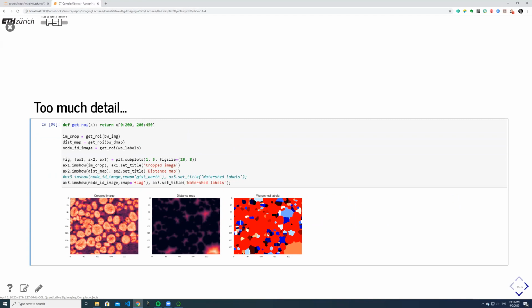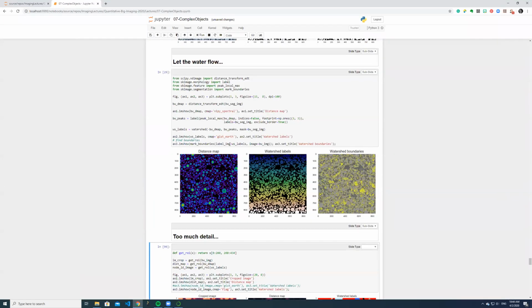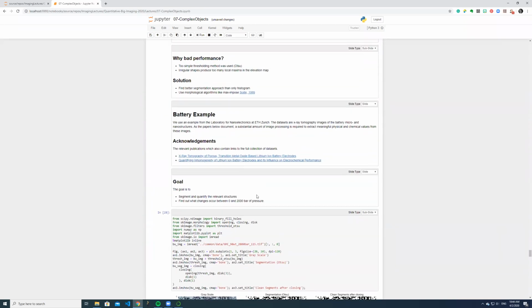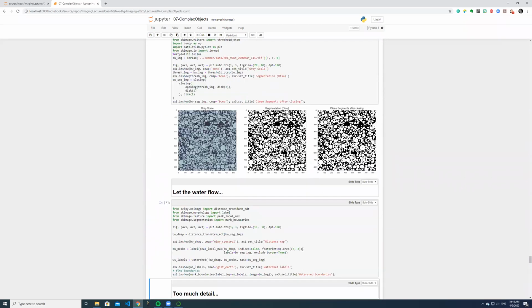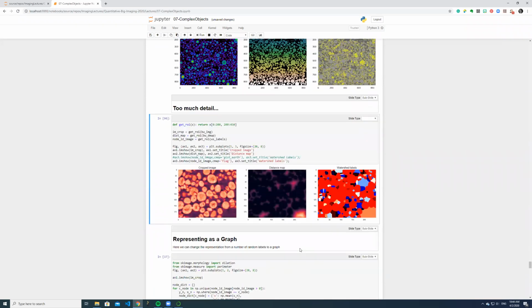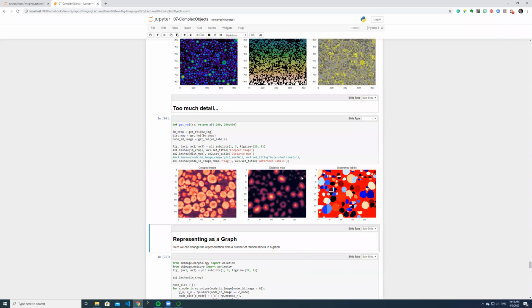And that is, actually, I think something went wrong here. I have to go back. So this is what I wanted to show. I somehow got the inverse. I don't know why, but that is what I got. And let's go back.